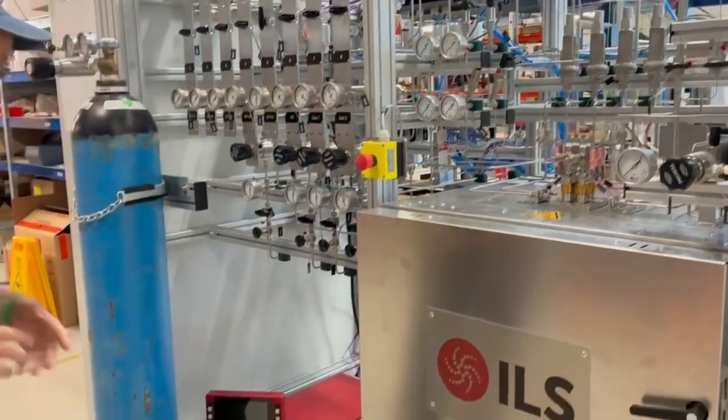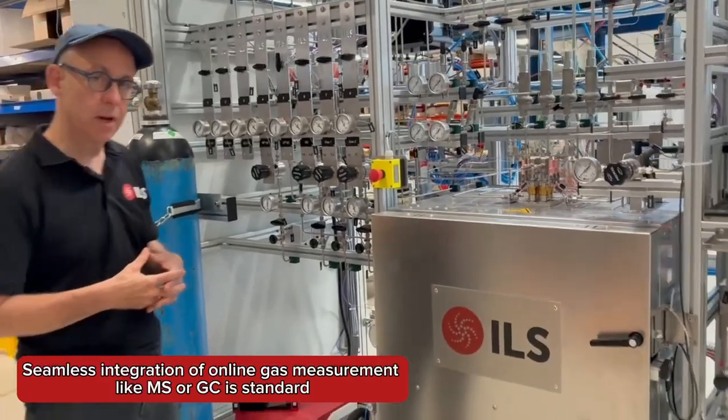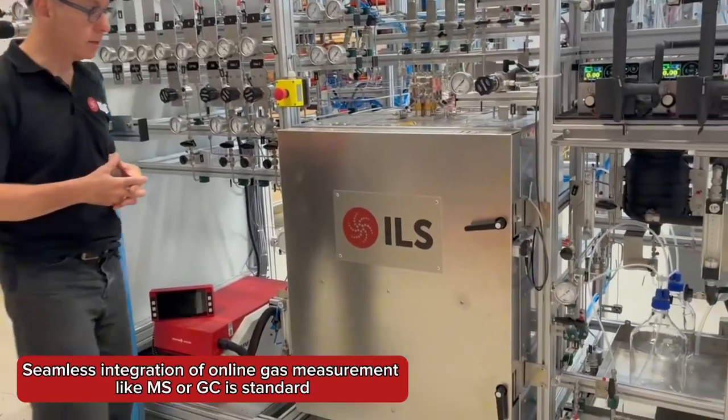At the moment, we have an MS placed in here just for the FAT testing. Ultimately, we'll have an online GC located in the unit.